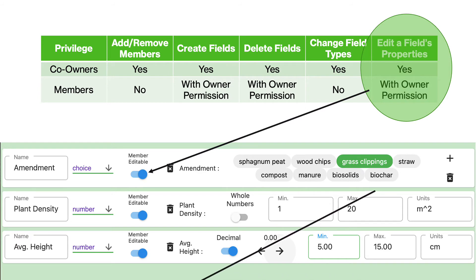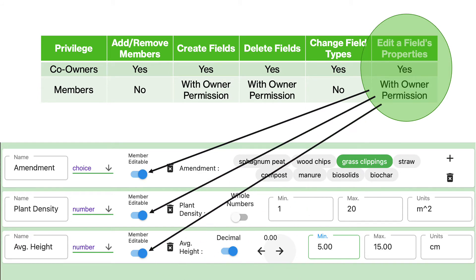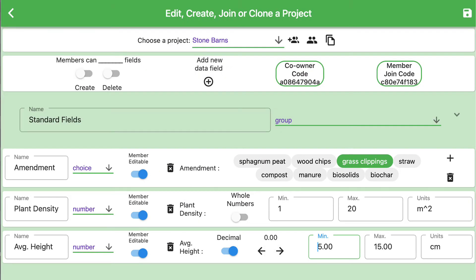Now let's get back to the field-specific permissions. If a field is member editable, that means members can alter the settings you have created on the right, such as precision, minimum, maximum, and units. Perhaps you don't want them to be able to do that, so you can turn off their ability to change those settings. Here we've changed these to not member editable.